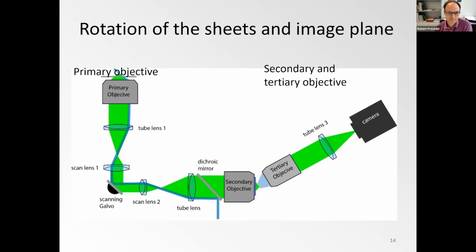But yeah, I think there are interesting ideas, also adding a second objective from the top, not in a 4π sense, but just to increase what you can interrogate, both in an OPM scheme, like having an opposite side view of the sample, but also on the excitation side, what you can launch into it. So if I weren't moving to an 11th floor, I might consider it.